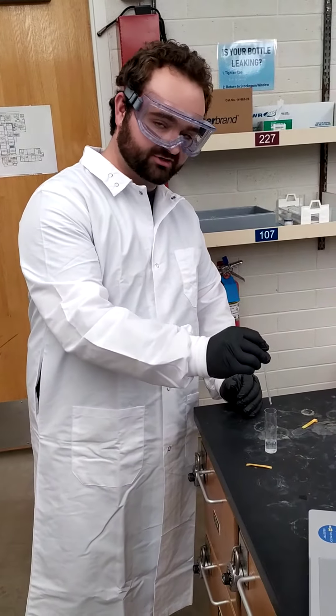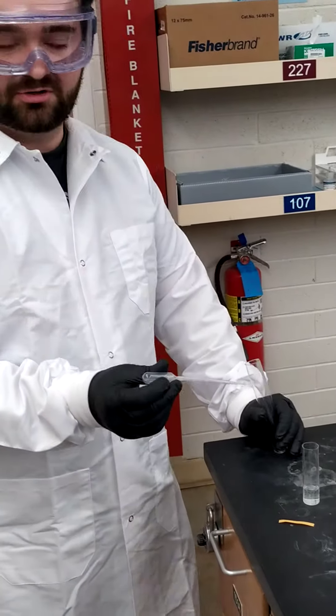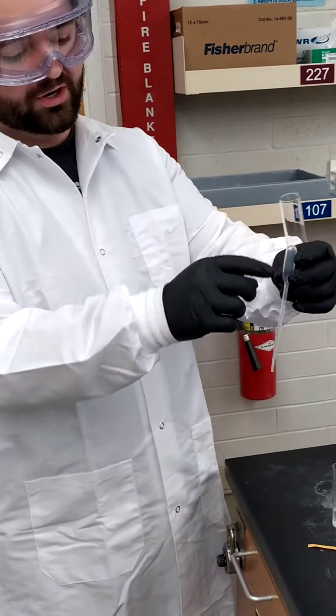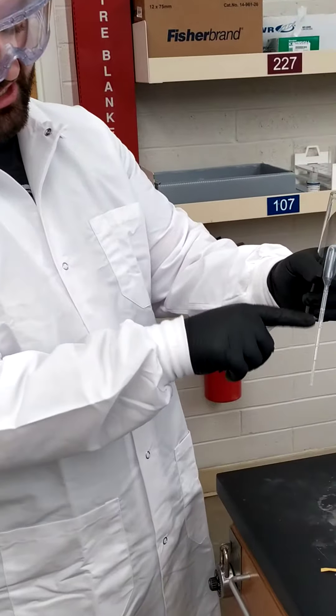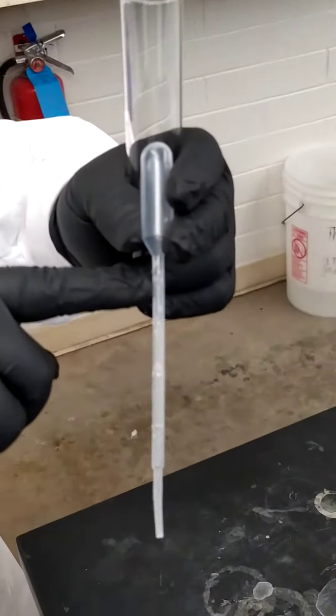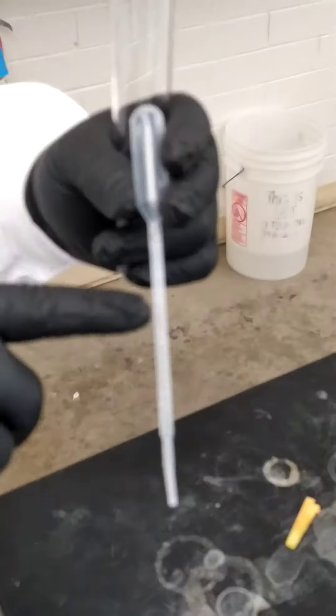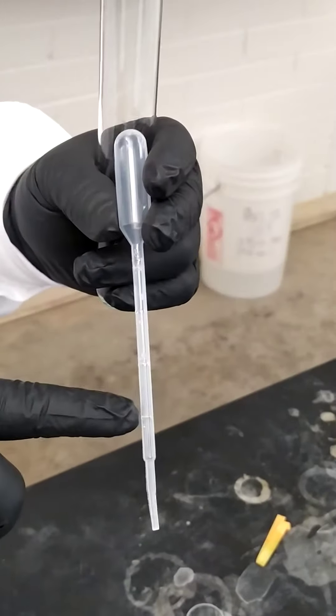So first of all, make sure it's empty. This one is not. But what you're going to do is we're going to do one milliliter. This is marked on the sides as you can see. Up here is one milliliter, half a milliliter, and 0.75 and 0.25.